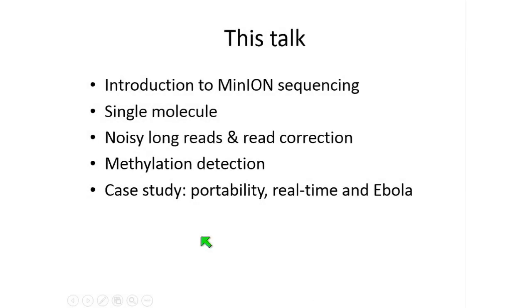Excellent. So I'm going to give a brief introduction to nanopore sequencing and then talk about some of the particular characteristics of nanopore sequencing that I think make it unique and interesting. And then I'm going to be a bit indulgent and talk not about human genetics, but about a case study that we were recently involved in, and continue to be involved in, which is pathogen outbreaks, particularly with Ebola, and talking about portability.